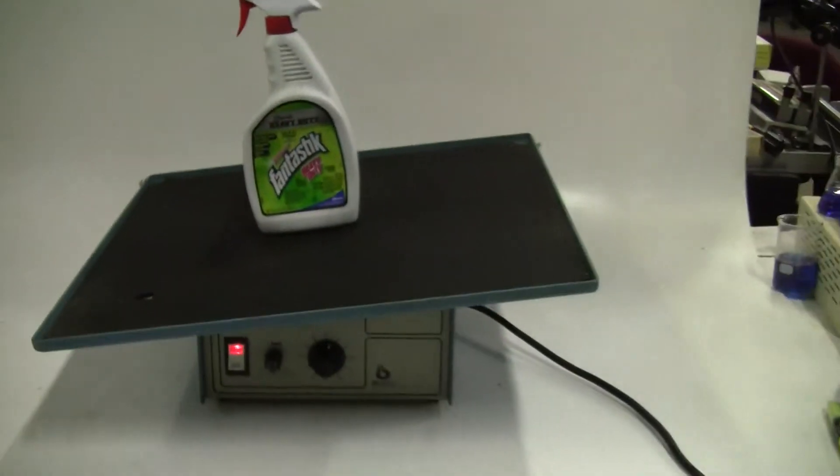Everything looks relatively clean, and it's rocking fantastic.